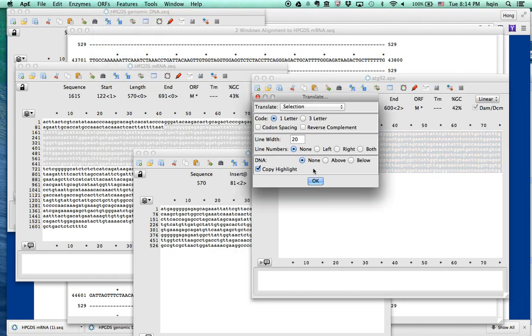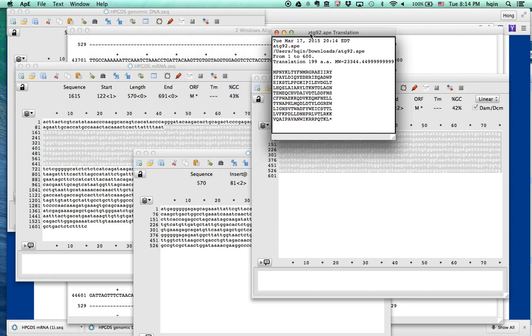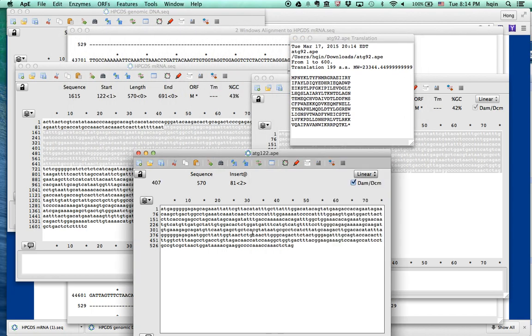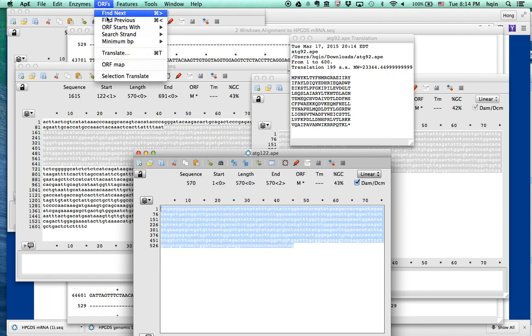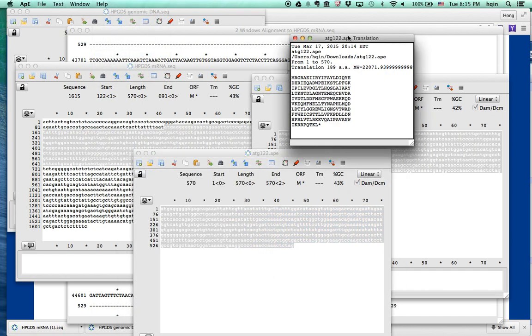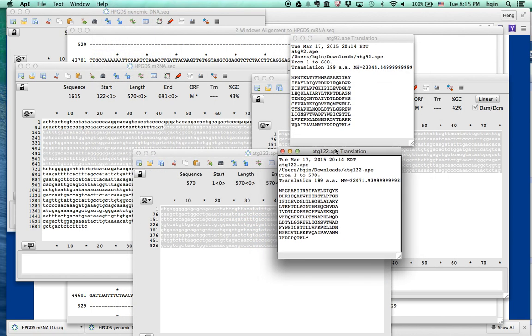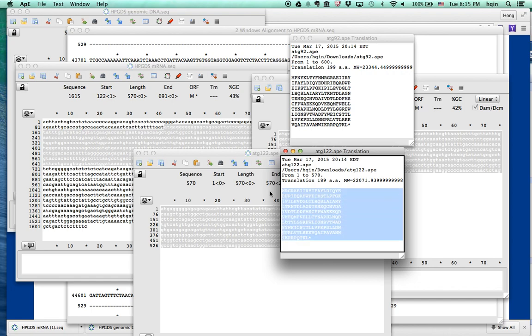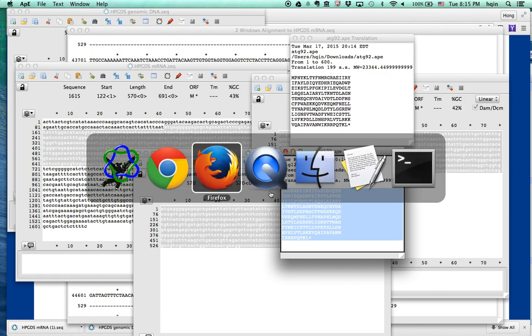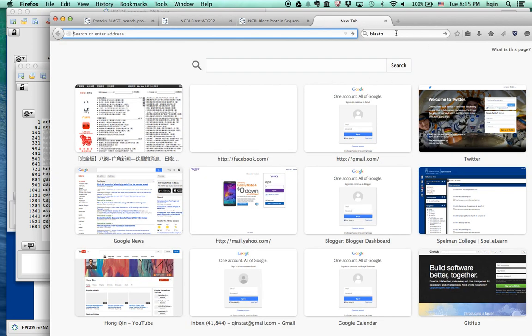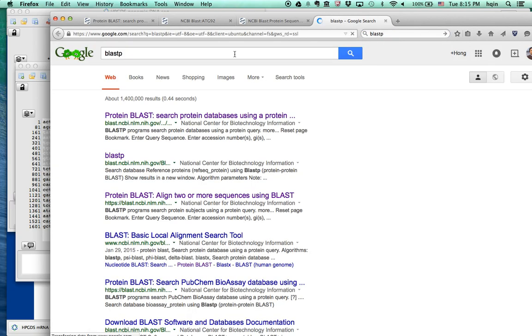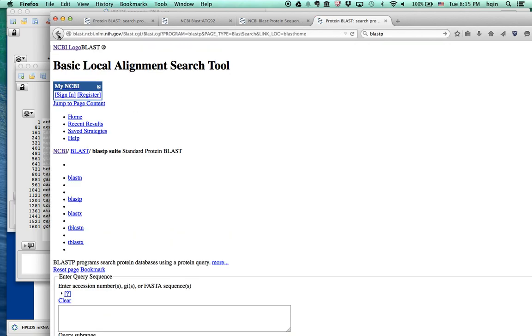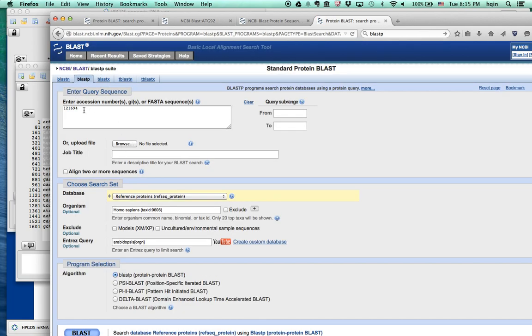So I'm going to translate the ATG start at 92. This one gave me 199 amino acids. Then, let's translate the ATG start at 122. This one gave me 189. So, which one do you think the NCBI database would use? I'm not sure. Let's go back to the NCBI BLAST. So, how do you find out NCBI BLAST? You can BLAST P. This is for protein BLAST. The first one doesn't seem to work. The second one.